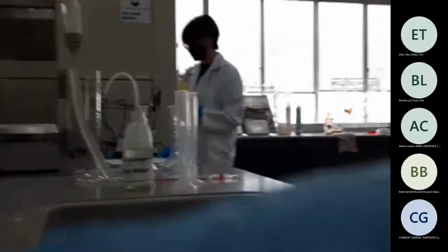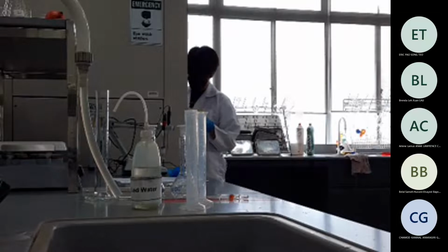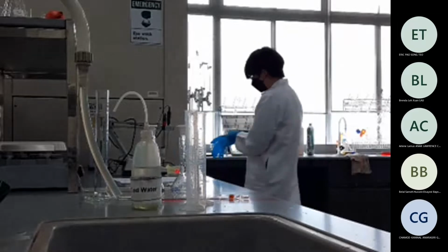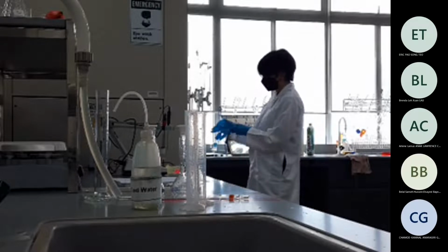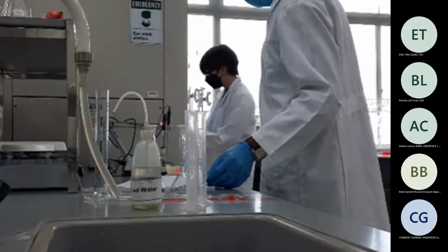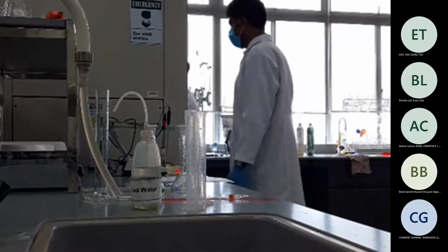I don't know if you guys can see or not. You don't need to take a lot, just a little bit, because you need to take just 10 milliliter from here.